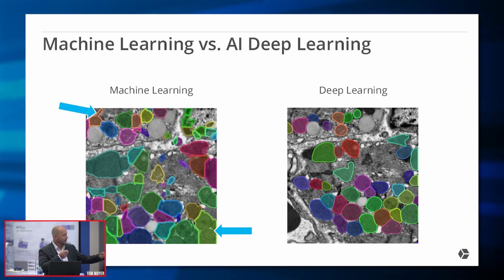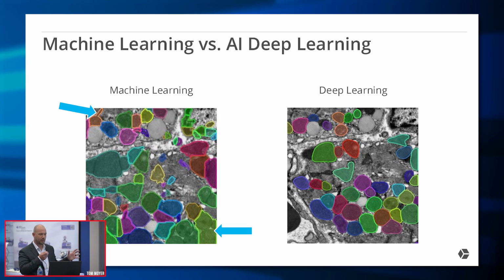So we have used a splitting technique that's present in Image Pro to try our best to distinguish between those different objects. But you can see we have still counted areas that we're not interested in, and we have not performed splits in particular areas. And on the right, again, this was a model that's included, that's pre-trained.